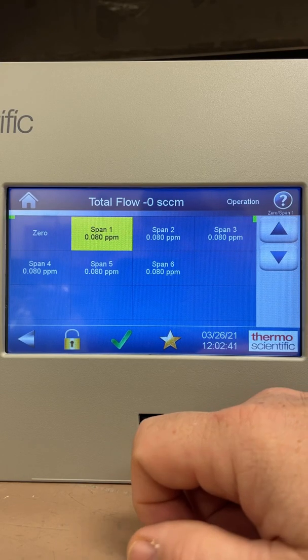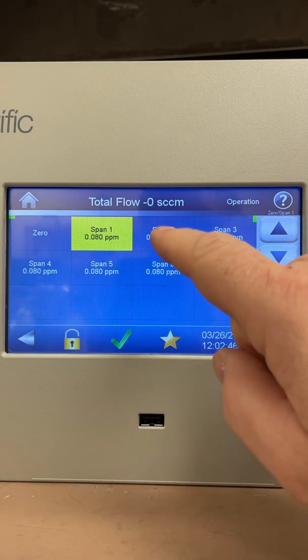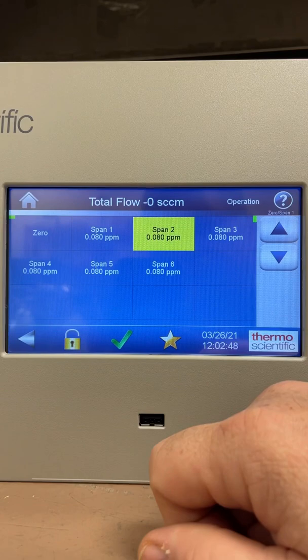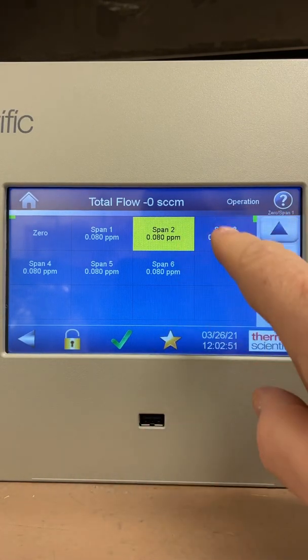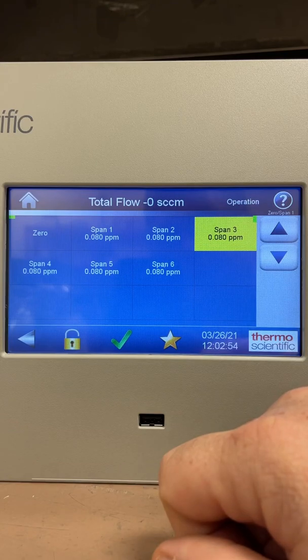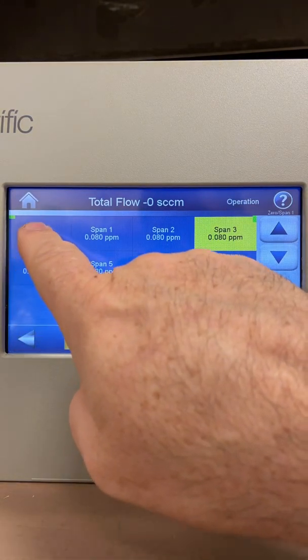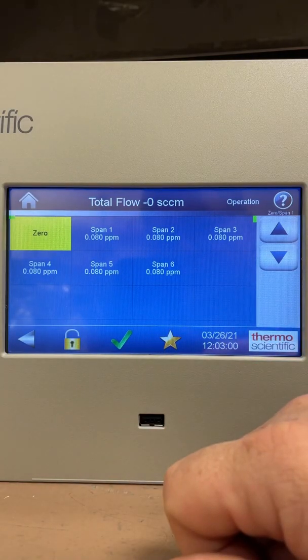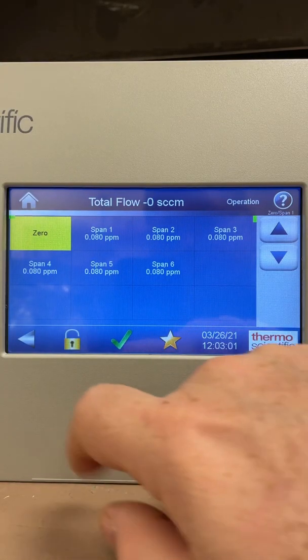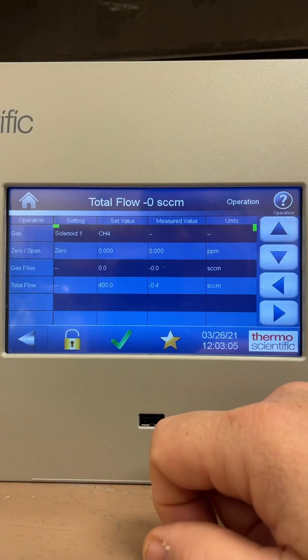I would run that for 15 minutes, then simply go to span 2 for the midpoint, and after 15 minutes on to span 3, and so on. It's that simple. After I'm all done, I go back to zero, it shuts off the span solenoid, and I can go back to that calibration screen again.